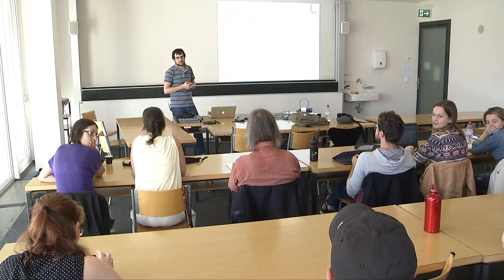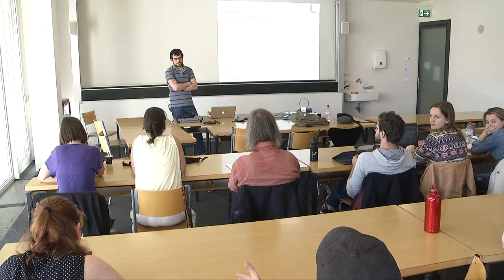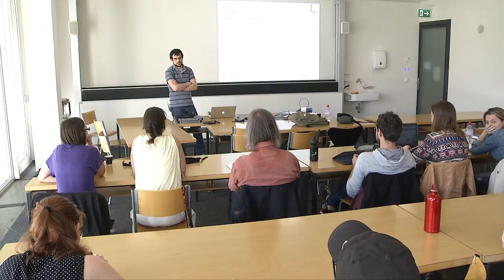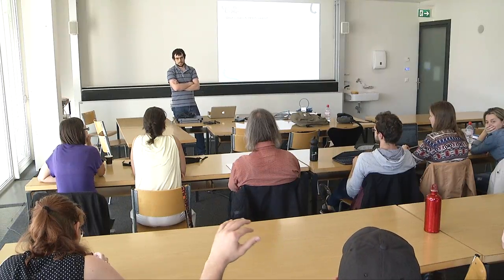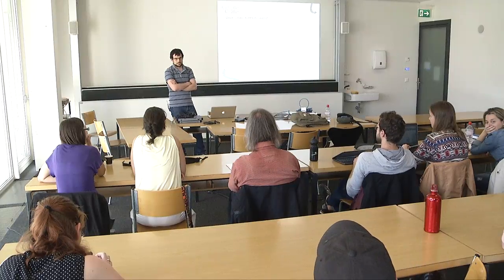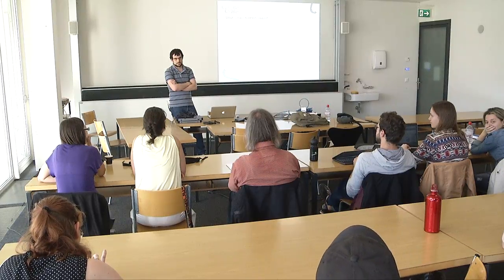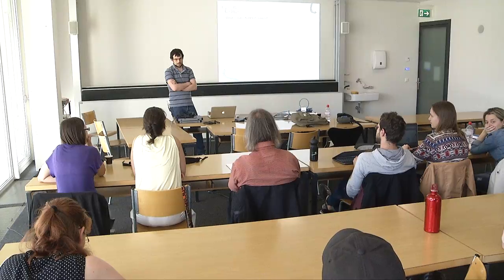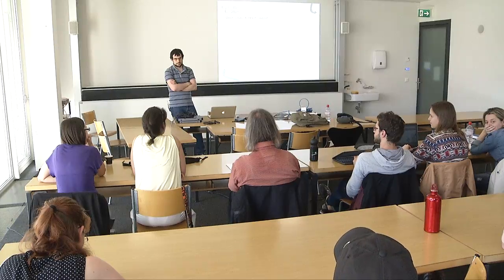Well, I actually think it's semantics. I think you can split that into targeted acquisition and targeted analysis. Regarding targeted acquisition, yes, DDA might be targeted acquisition because the first quadrupole is fixed, so you target one precursor, except for the MS1 scan. I think it's not really correct to call it simply targeted proteomics; you would have to split it into targeted acquisition and targeted analysis. Targeted acquisition is, as I said, DDA and MRM. SWATH is not targeted acquisition because you have a wide quadrupole.